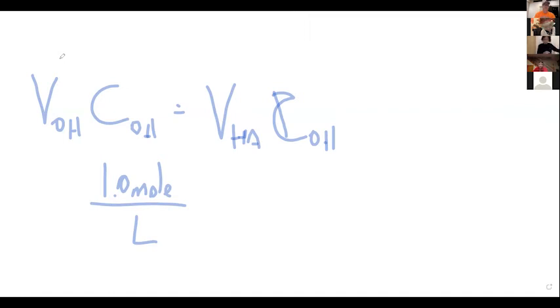So what was your volume of hydroxide you used? Should be around 4 or 5 mils. 5.2. Okay.